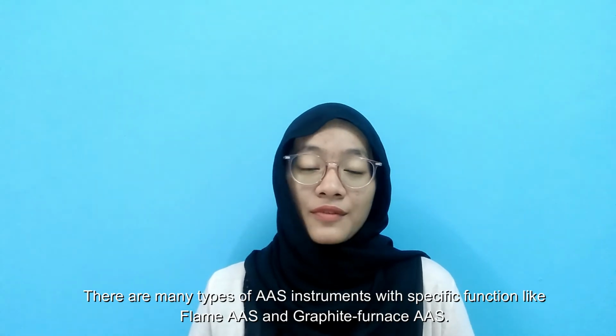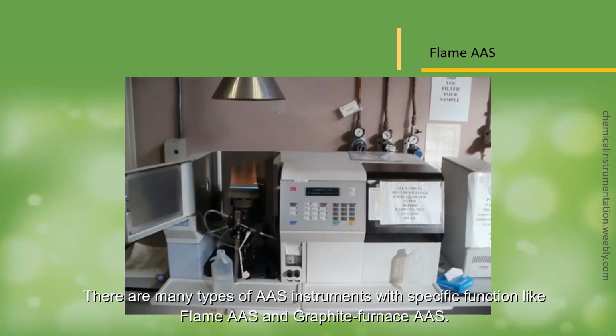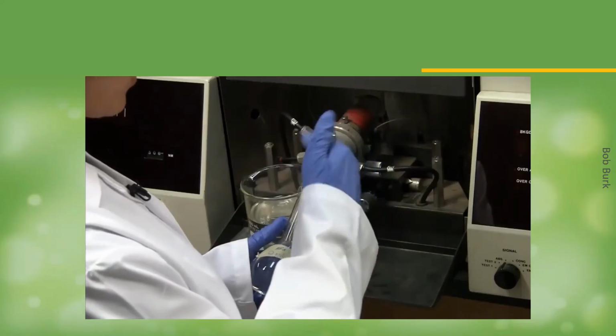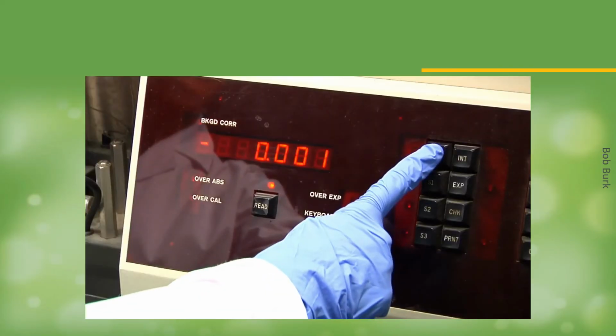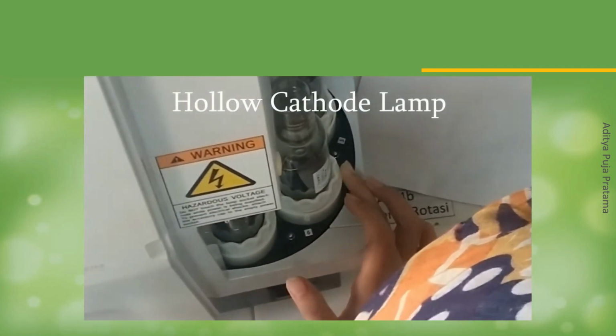There are many types of AAS instruments with specific functions, like flame AAS and graphite furnace AAS. In marine pollution, AAS can be used in heavy metal detection like lead, cadmium, zinc, manganese, and nickel. So, how does this work? Before that, we have to prepare a series of standard solutions, the sample, and the hollow cathode lamps.